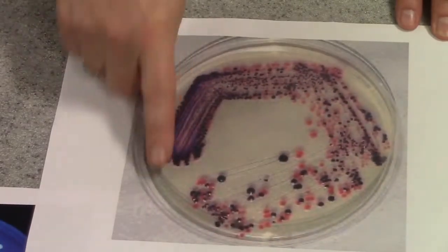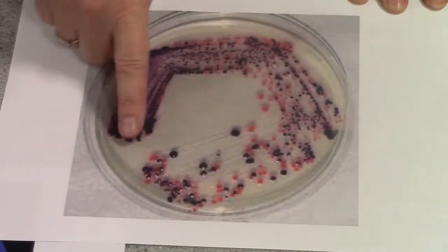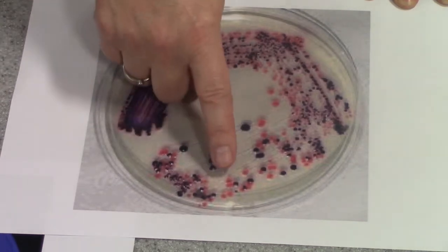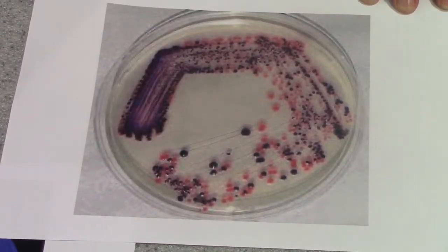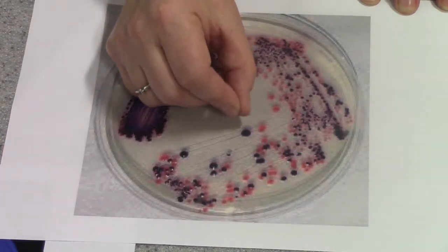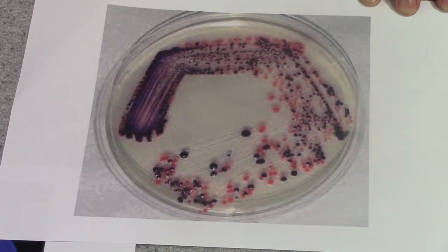Alternatively, if it's a mixed culture, you may by the end be able to see individual colonies of the different bacteria in the culture. For example, we've got the purple ones and the pink ones. It would be possible, using a sterilised wire loop, to actually pick off individual colonies to subculture them.